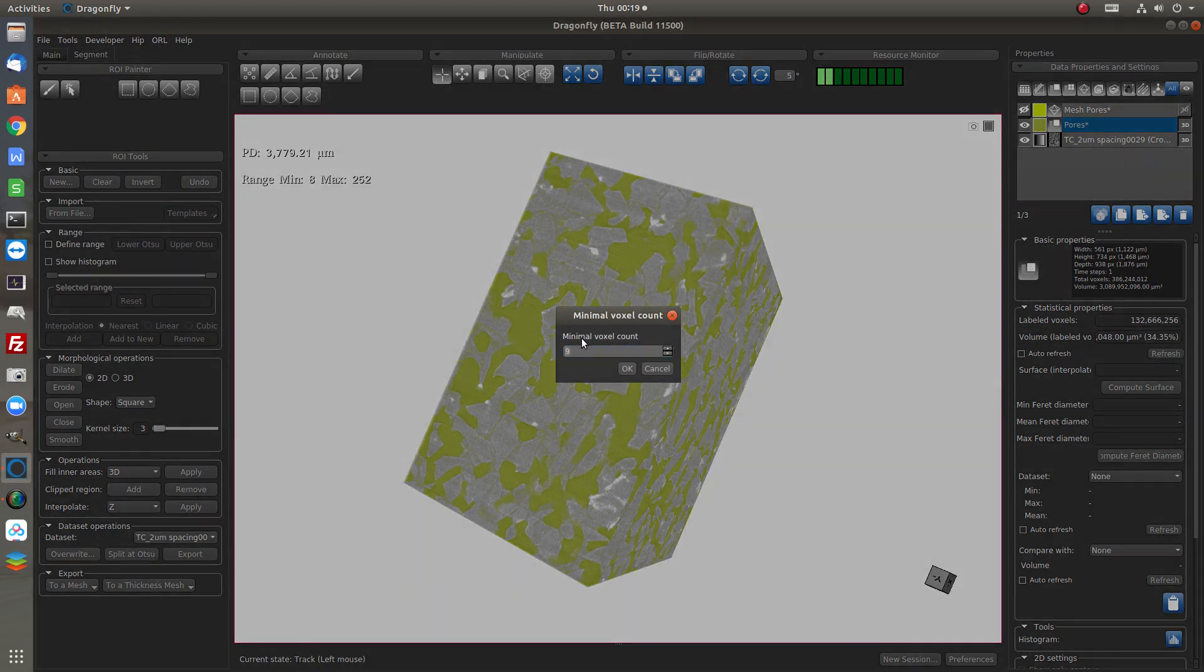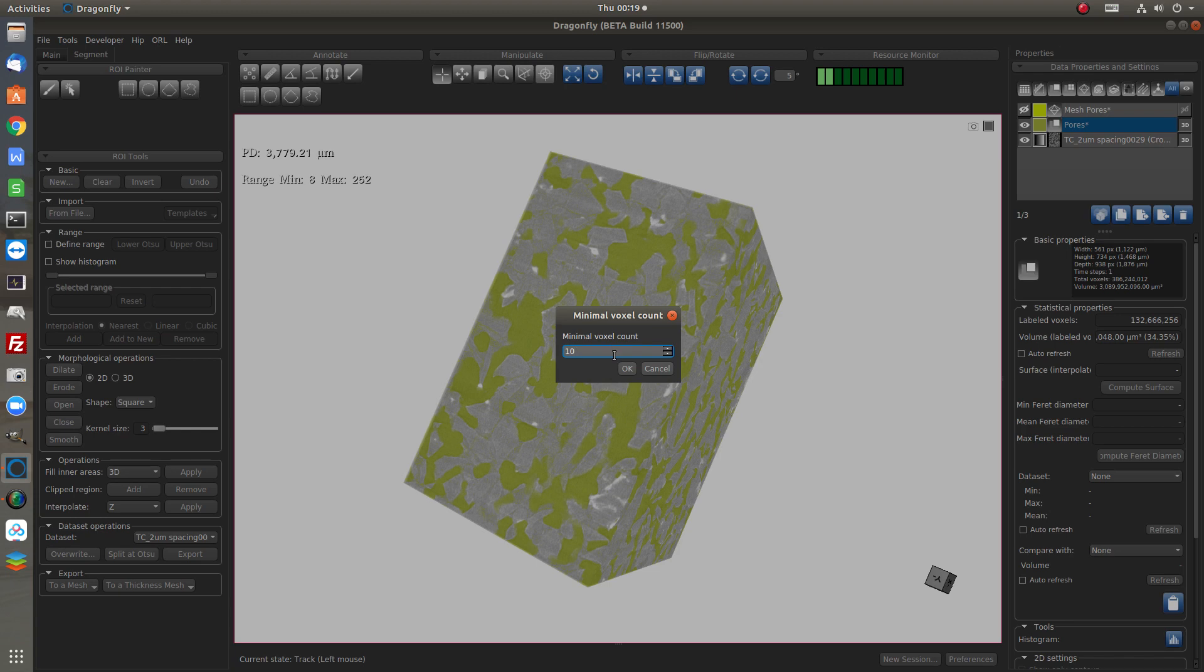So the minimum voxel number, voxel count is 9. We can set it to something like 10. It means we take only the pores with minimum number of voxels is 10. Every pore smaller than 10 voxels will be deleted from this ROI.